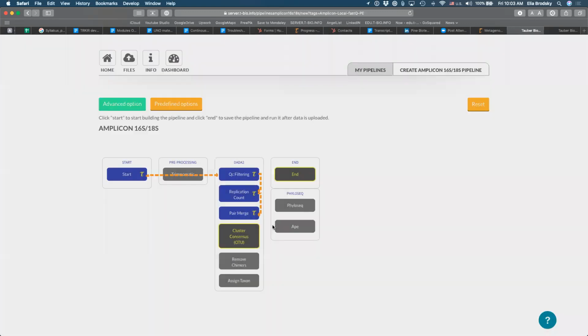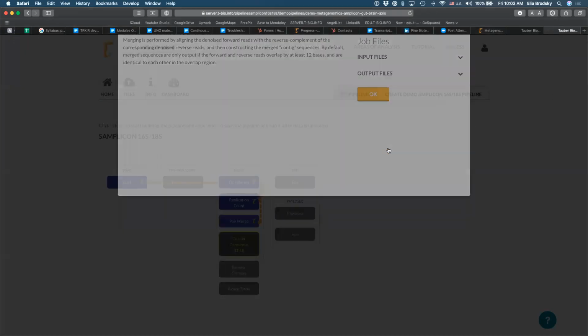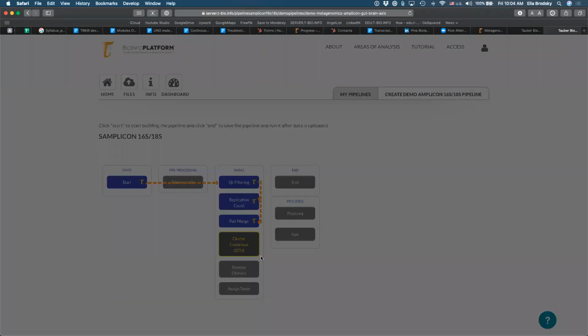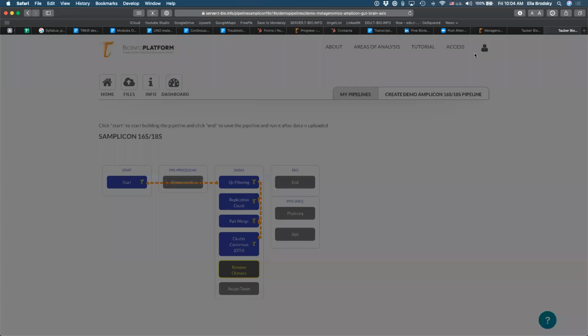These settings right here are flexible. And now we need to combine them into these operational taxonomic units, which will be done using clustering. So we actually want to look at similarity of sequences and combine them together. If we click here on OK, you can look at OTUs. As you remember, we are going to combine them together by similarity of sequence. Let's click on OK.